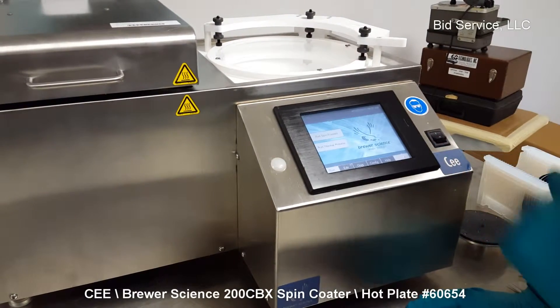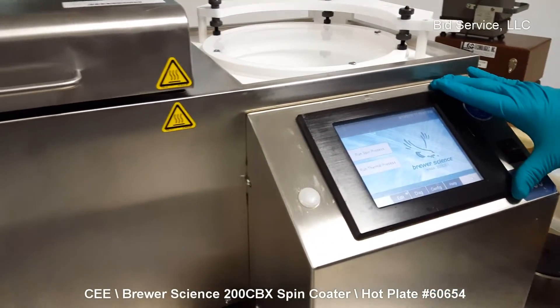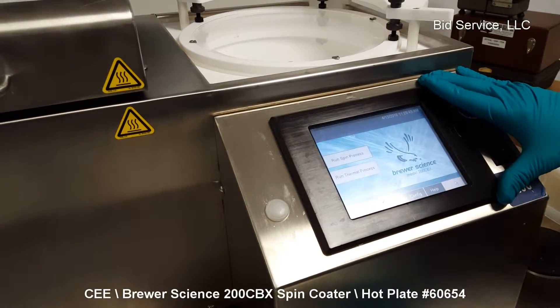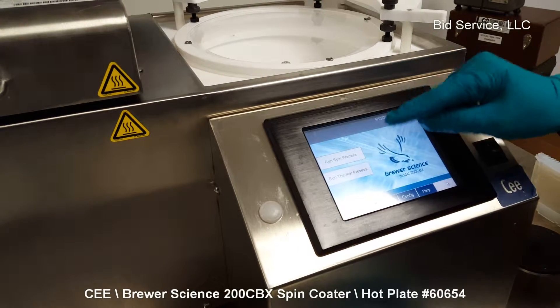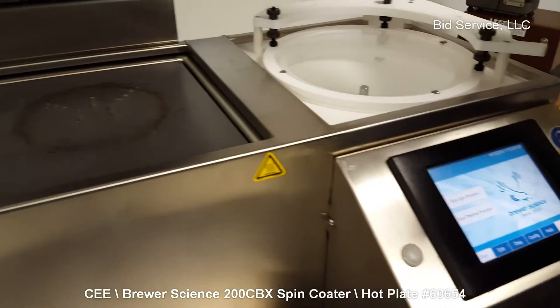The system is a Windows-driven system with a touch screen — it's very simple to use. It allows you to program processes and recipes for both spin and for thermal, which is basically the hot plate.